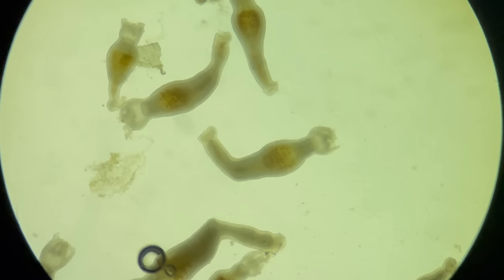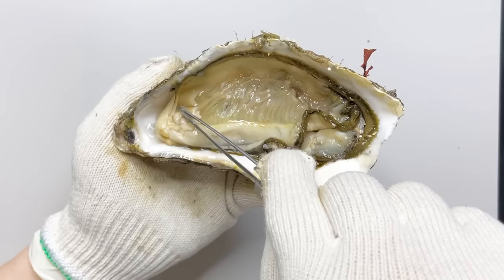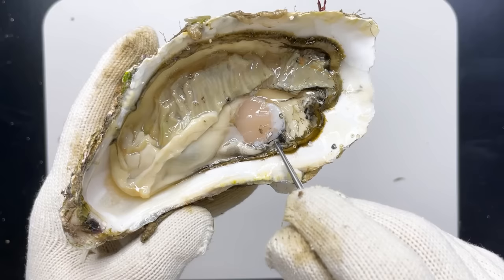It's even alive. The food filtered through the gills moves through the cilia to the labial palps and enters the oyster's mouth. The food that enters the mouth passes through the stomach and the gut, and then exits to the anus next to the adductor muscle. The part right here is the anus of the oyster. So if you press here, you can see the oyster's poop.